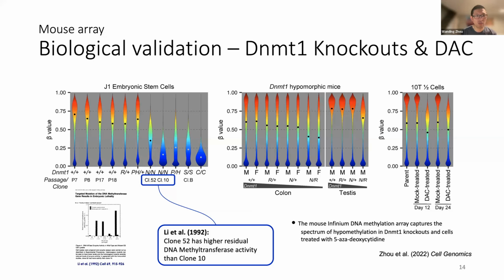As you can see, the wild types, regardless of whether it's cells or a mouse, show a typical bimodal distribution of methylation with a high median methylation level globally. However, the heterozygous cases show some slight loss of methylation, but not that noticeable. But the most dramatic methylation loss has been observed in cases of homozygous variants or mutants, as well as compound heterozygous cases.